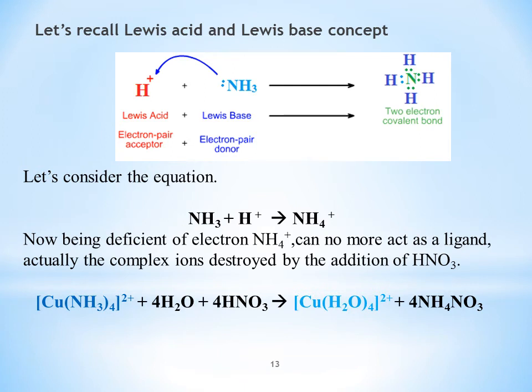So in this way, there is no more tetraamine copper(II) ion complex, and therefore the royal blue color is no longer retained, and the sky blue colored aqua complex of copper forms. So the royal blue color of the solution changed to sky blue.